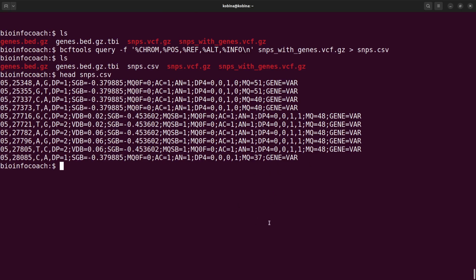So today we've learned how to add gene names to variants in a VCF file using bcftools. All right, so there are other tutorials that you can use to manipulate or handle VCF files using bcftools, and I have an entire playlist on that. So check the description box and you will find the link to watch those videos.